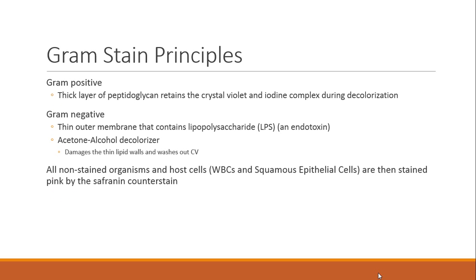So gram stain principles. Is everybody okay with this? The principle is why it occurs the way it does, or how a positive is positive. Okay, and that's important. We're going to divvy out some immunoassays, poster topics for you. I have a lot of students kind of get confused between the purpose and the principle. So the purpose tells me what. It answers the question, what. And the principle answers why or how. So how a gram-positive organism stains gram-positive, or how a gram-negative. You got to tell me.